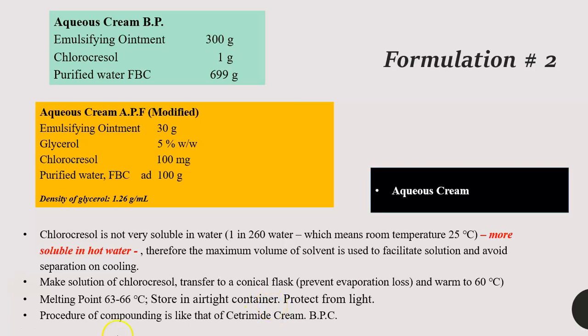No, you would make the cream similar to cetrimide. Why? You dissolve the chlorocresol in the water phase and leave some of the water to rinse the beaker that is carrying the dissolved chlorocresol.